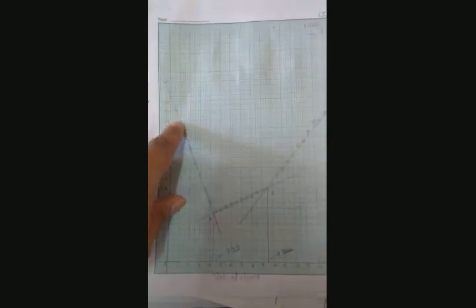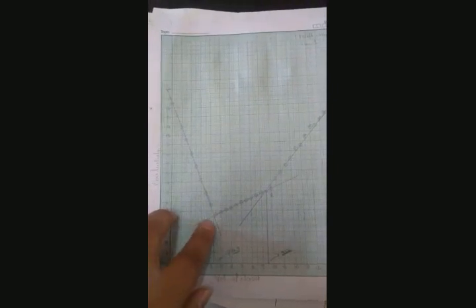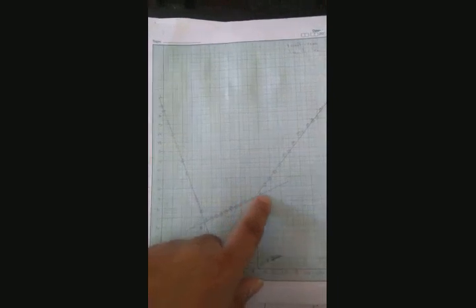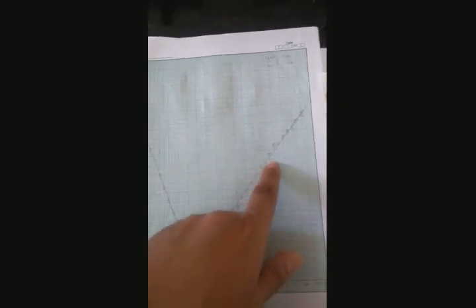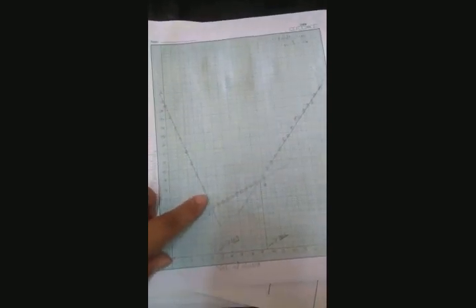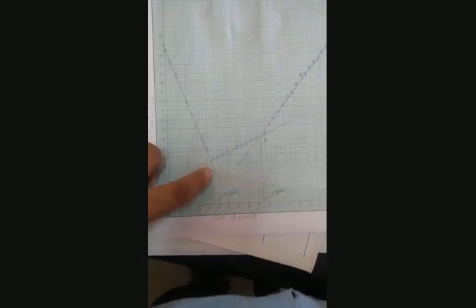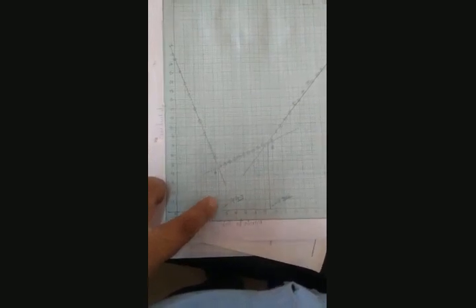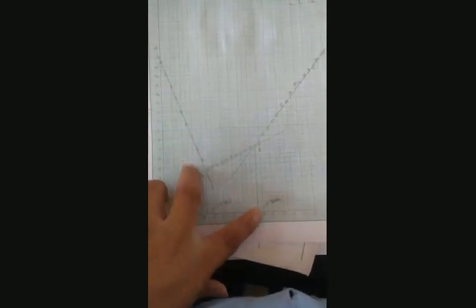You get a graph like this: the first straight line, the second straight line corresponds to the slight increase in the conductivity, and the third straight line corresponds to the steep increase in the conductivity. Intersect these straight lines, and from the intersection points you get volume V1 on the x-axis, and the second intersection point gives volume V2.